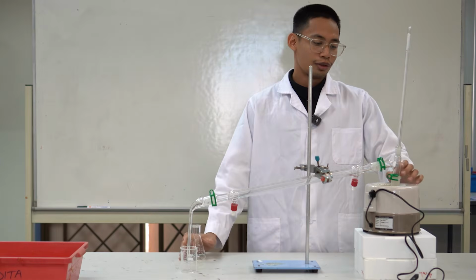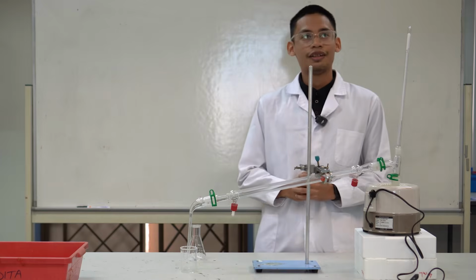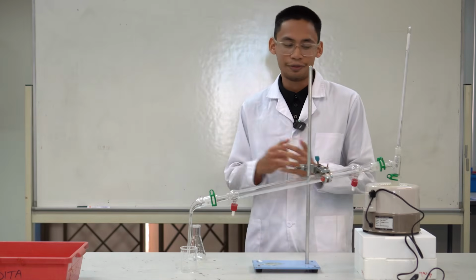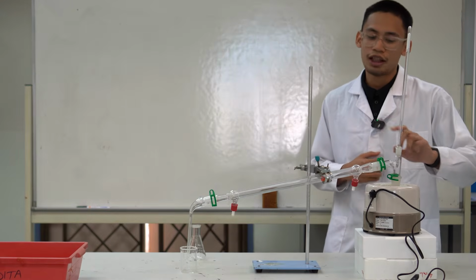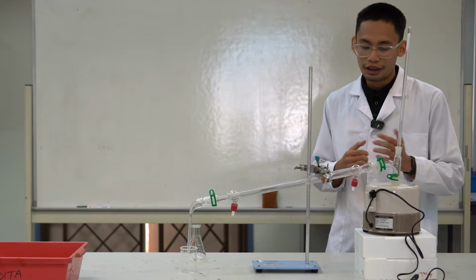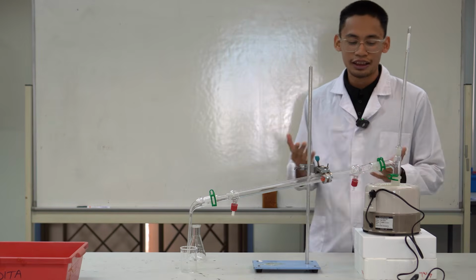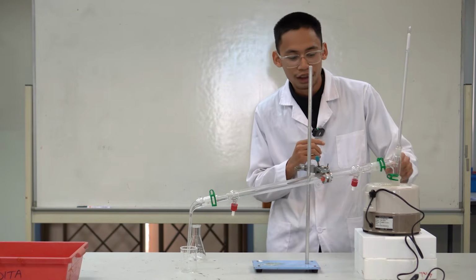The second one we have is the distillation head, or in industry we call it a 3-head adapter. As you can see here, it's connected to the thermometer, condenser, and round bottom flask. The purpose of this distillation head is basically to direct the vapor formed from the mixture into the condenser.